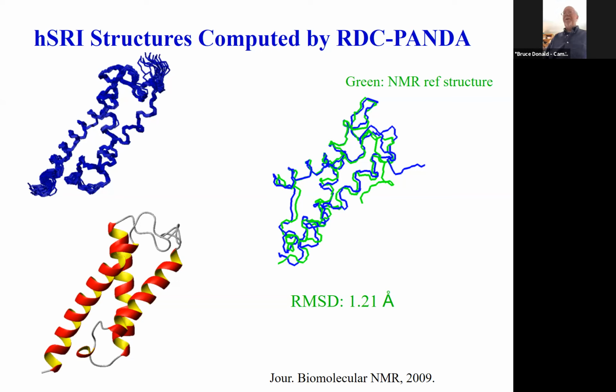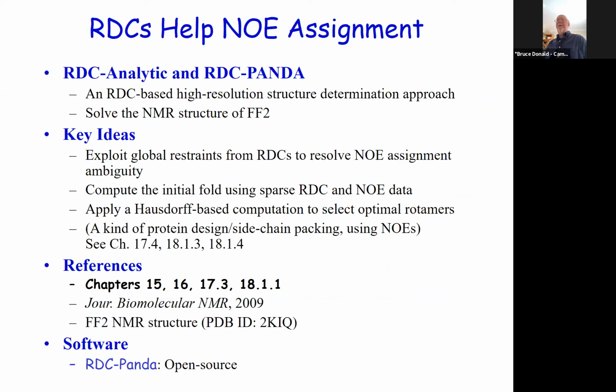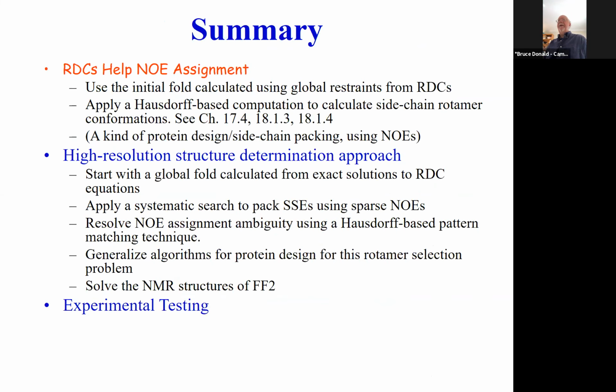If you meditate on it, you realize there are many situations in NMR where, if you collect your data, you can solve the structures by a series of linear equations followed by a series of quadratic equations. That's reassuring, because we understand the process and can get excellent solutions based on the exact solutions to these algebraic equations. Again, there's more data. I'll put these on the web, with lots of references to look at if you want to explore this area.